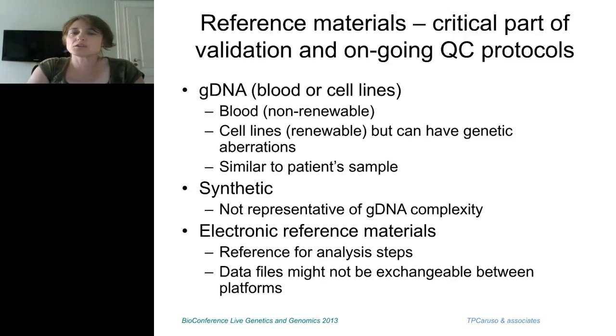So you can have genomic DNA, which is preferred because it's similar to the patient sample. Synthetic DNA is not really representative, and unless it's the only option, it's recommended that it's rather not used. And obviously, for data analysis, you need electronic reference materials.